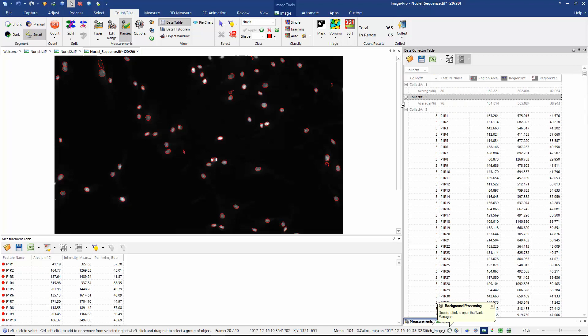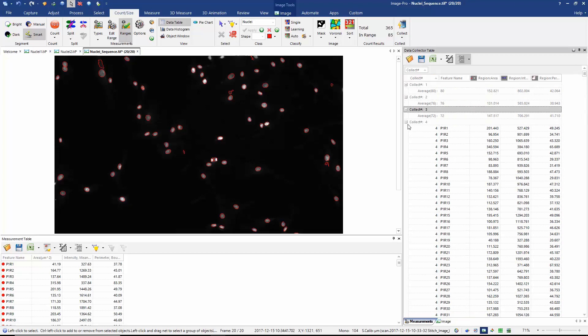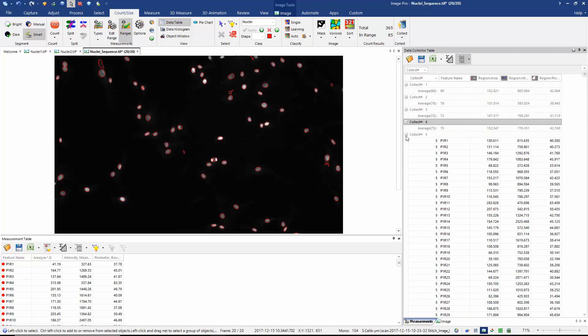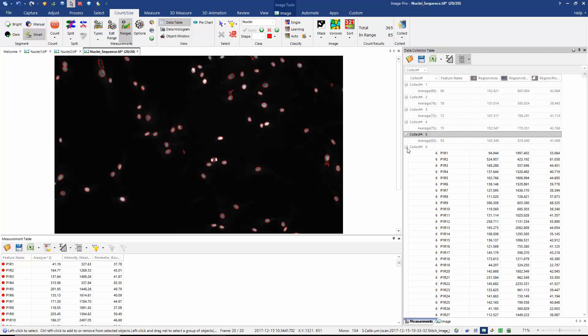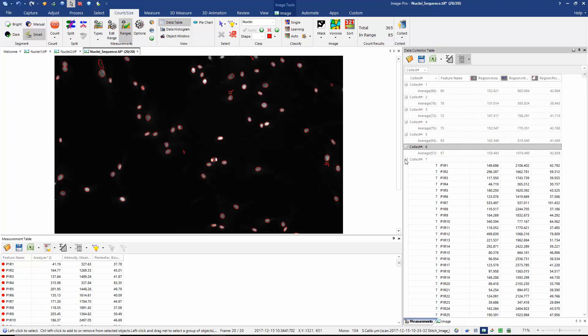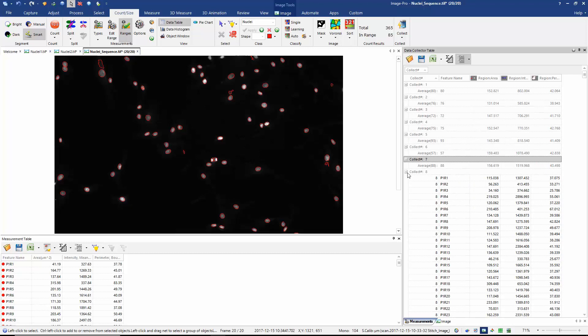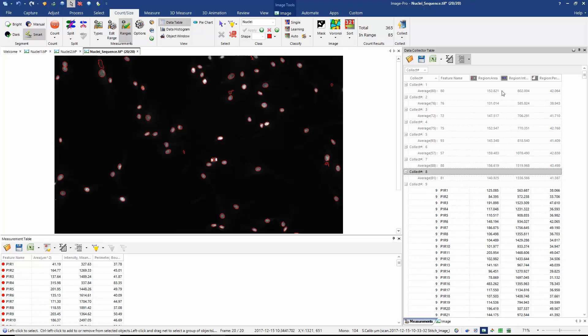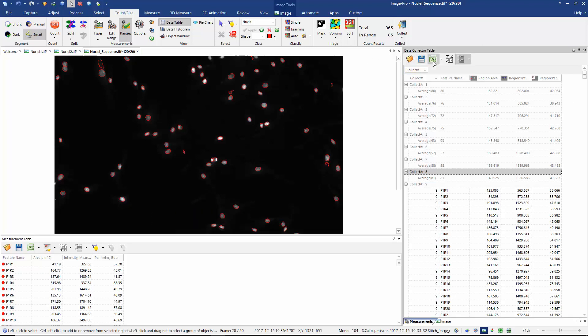If I collapse each of the collections in the table, we can see for each frame the average area, intensity, and perimeter of my objects.